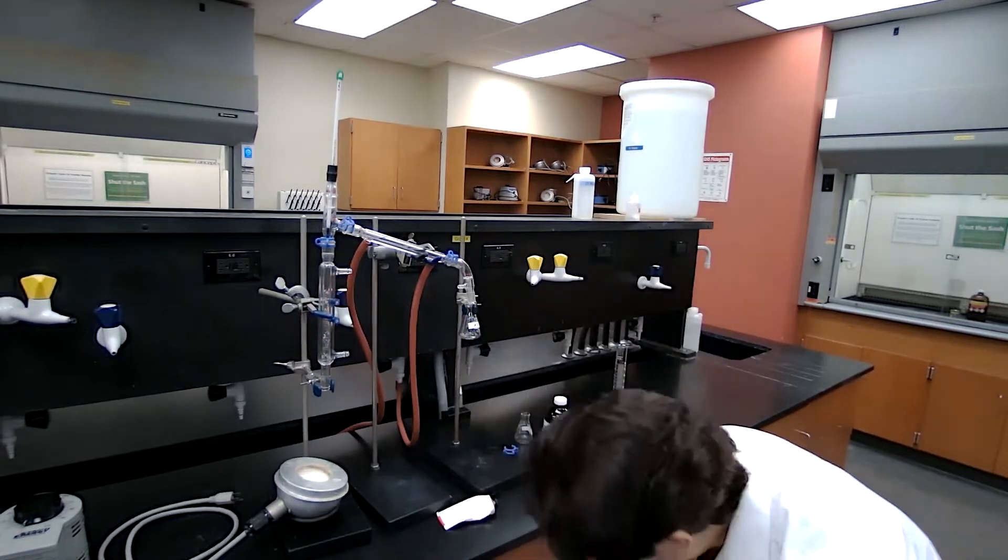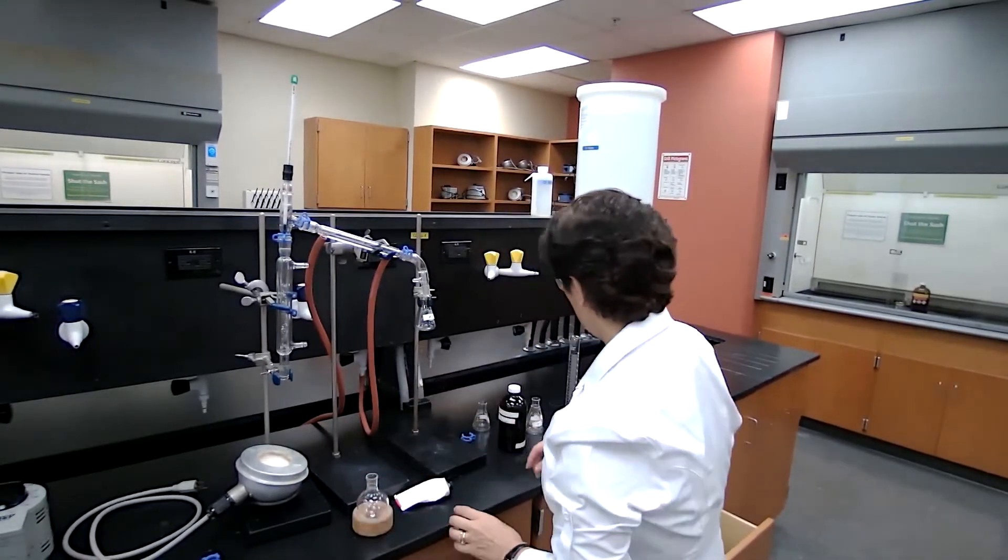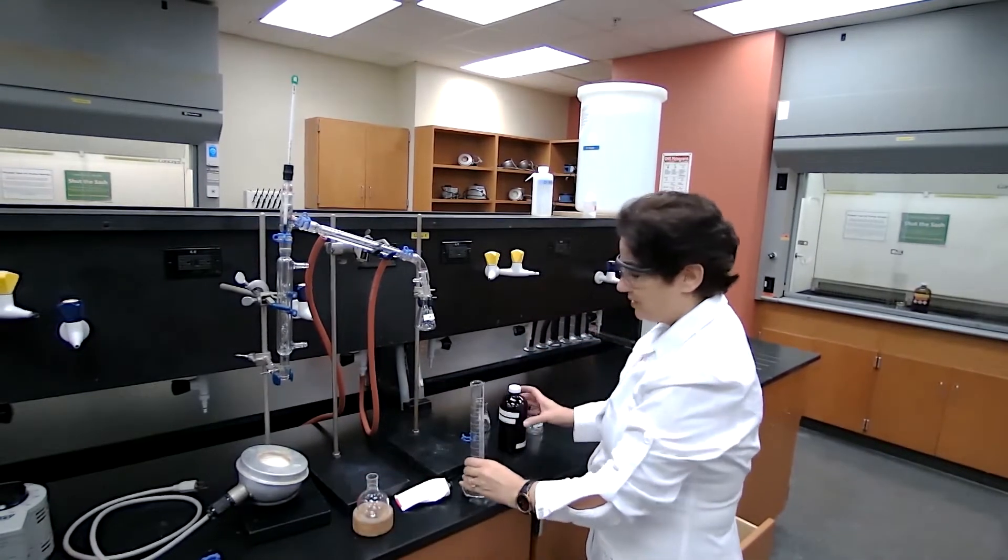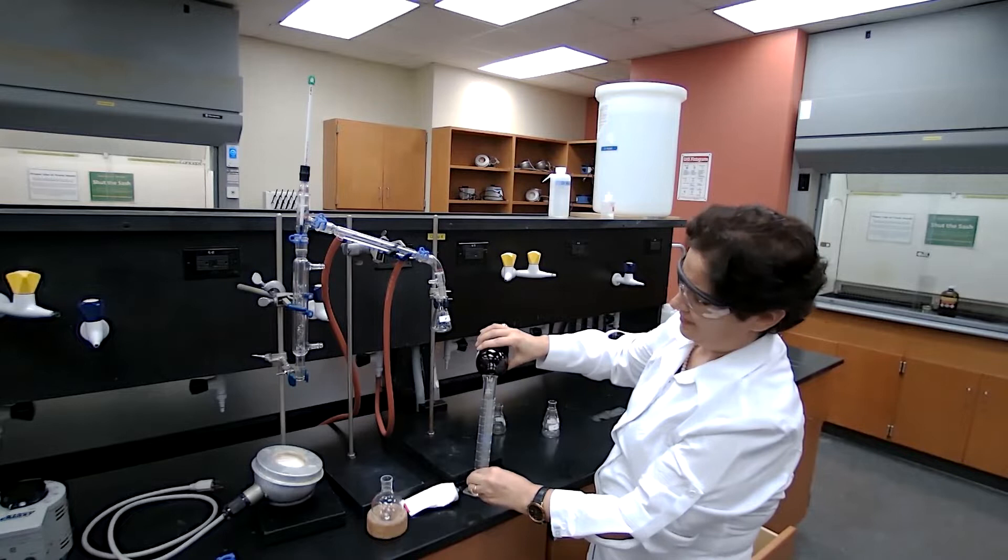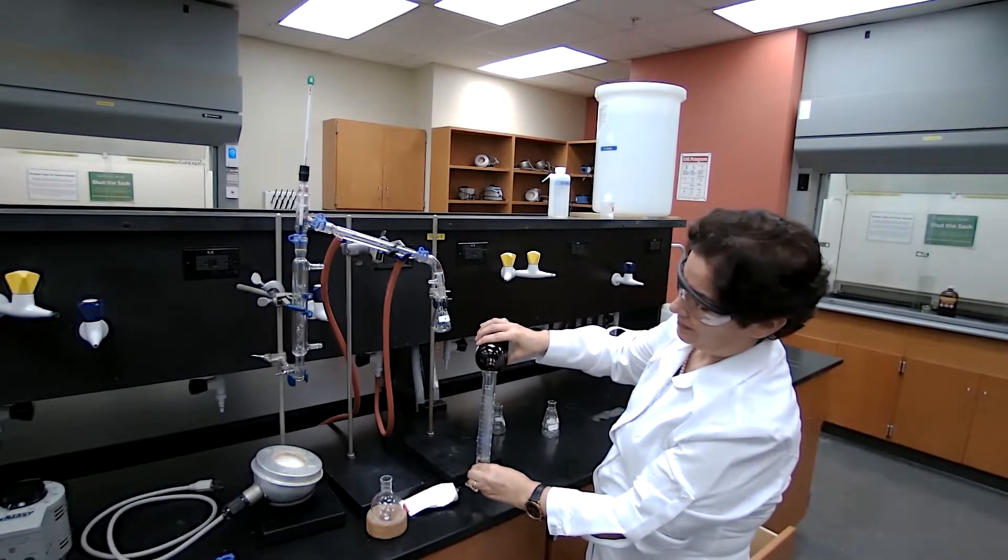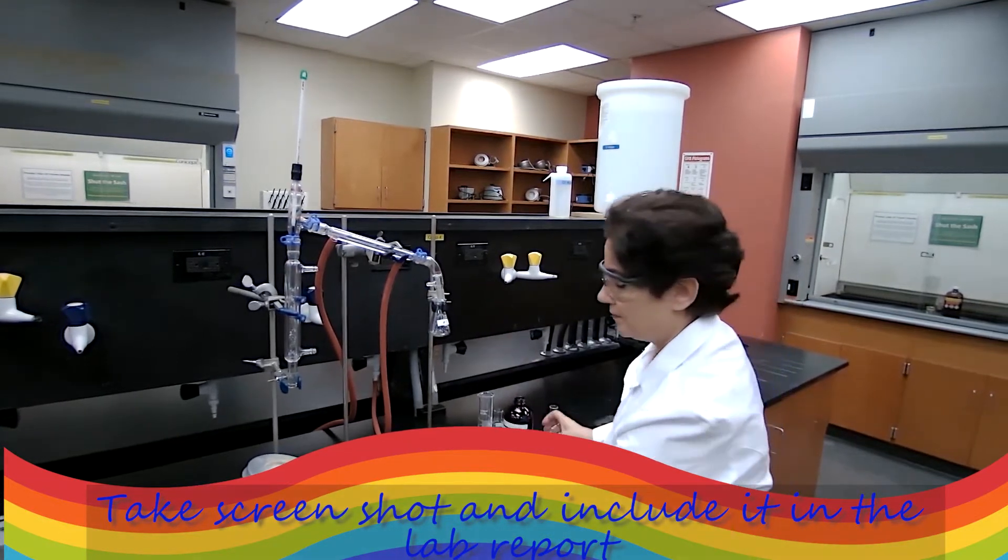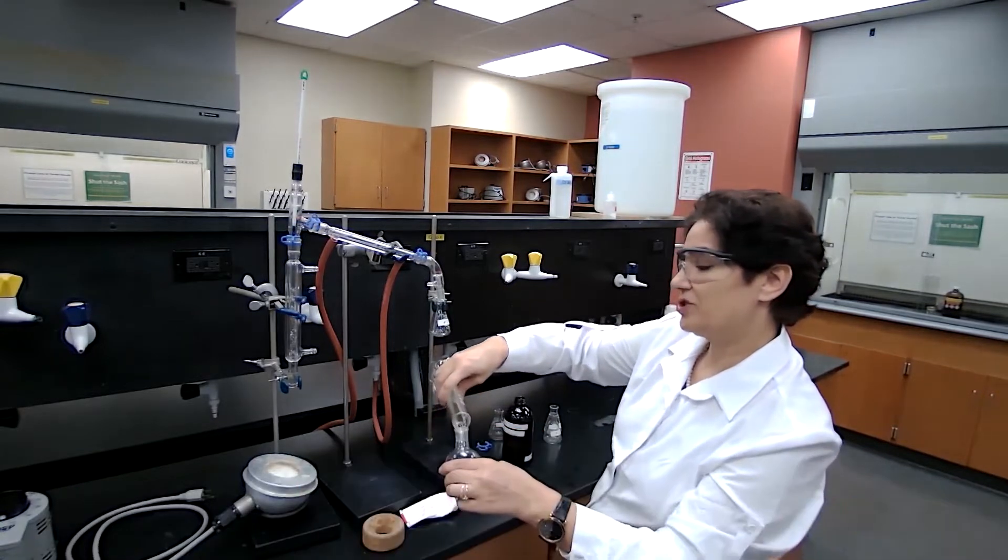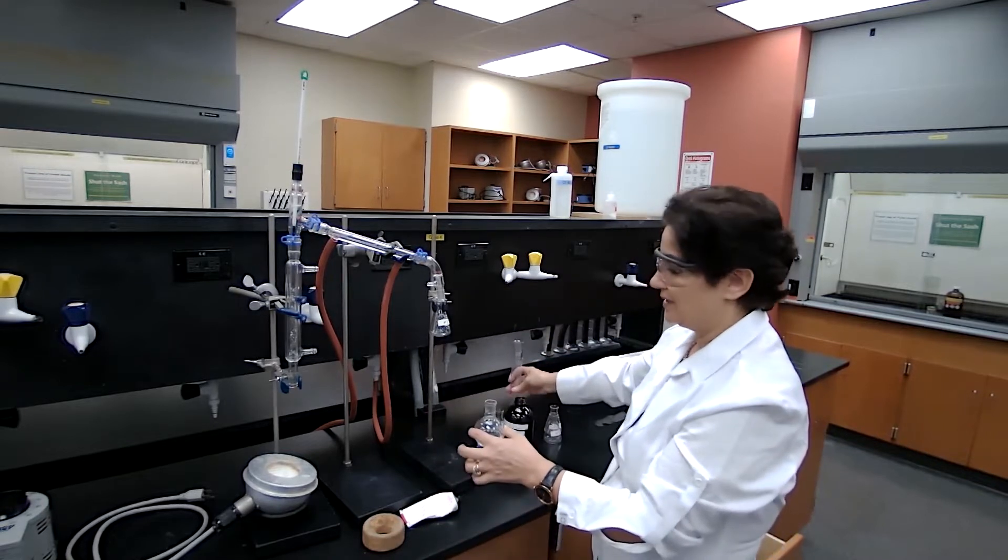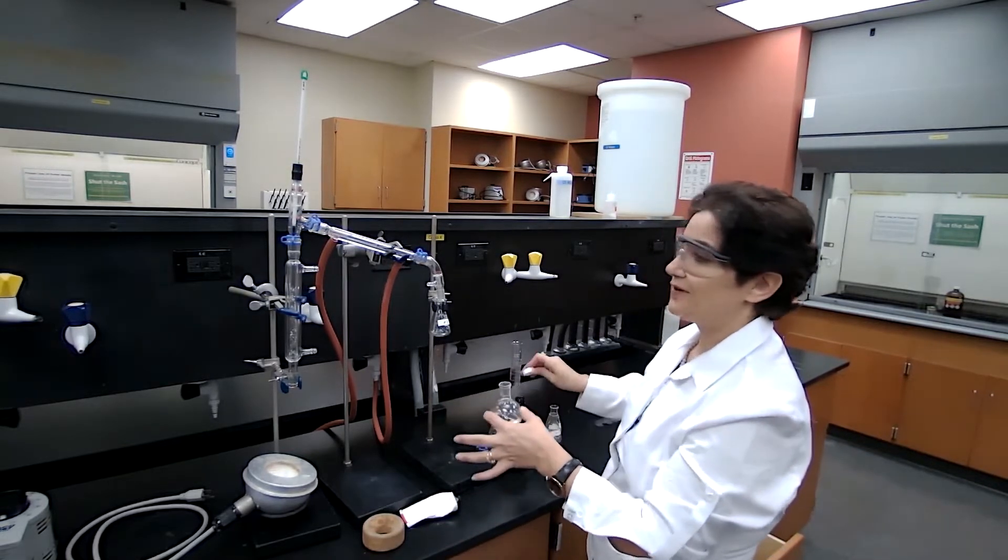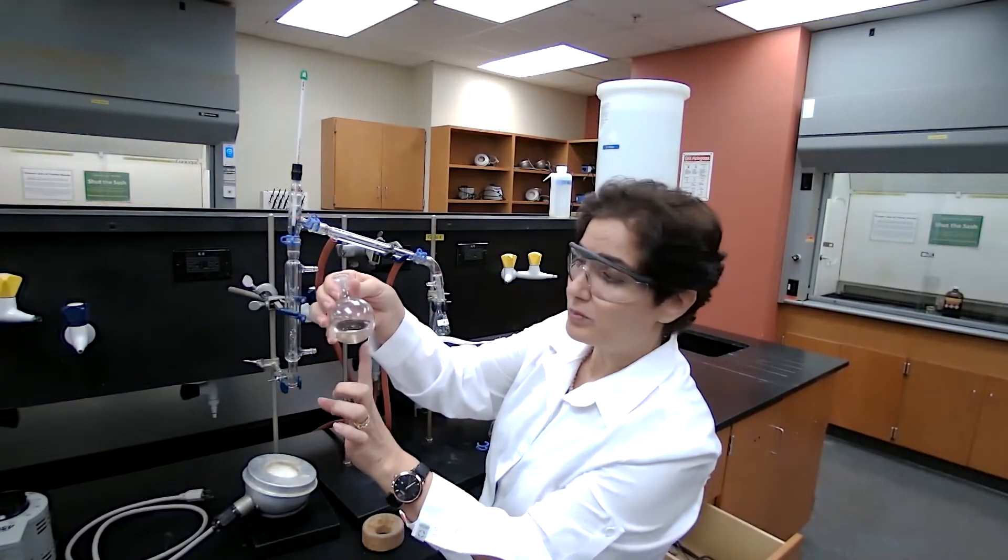I use my round bottom flask to support this flask. I will measure 30 milliliters of the mixture. This mixture is mixture of two liquids with different boiling points, but both of them are volatile. We are hoping that fractionating columns would allow us to separate. Make sure that we have three to four boiling chips.